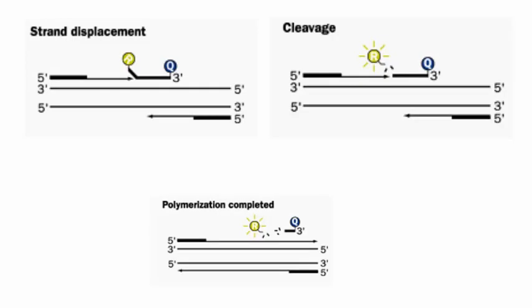Now, another methodology that was developed was TaqMan. And how TaqMan works is there's an extra probe that is designed, and that probe is designed to bind to one of your target DNA sequences. And on the end of the probe, there's both what's called a reporter and a quencher fluorescent molecule.